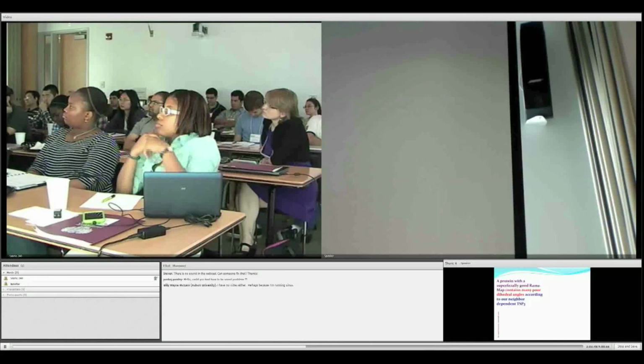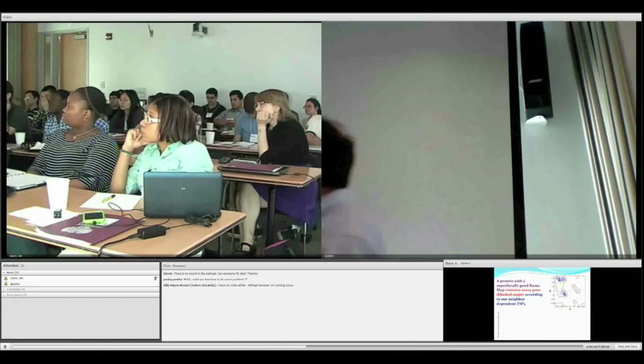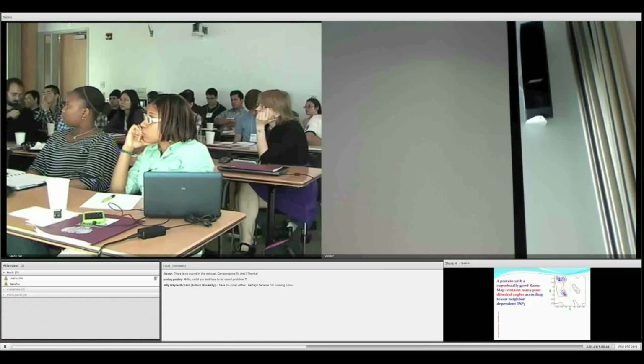You can see that there is actually a nice correlation between the resolution and the TSP value. The lower the resolution value, the better your TSP score, or lower TSP score, because we consider low the better. So this should confirm that this neighbor-dependent torsional angle potential is valid and matches very high resolution data.